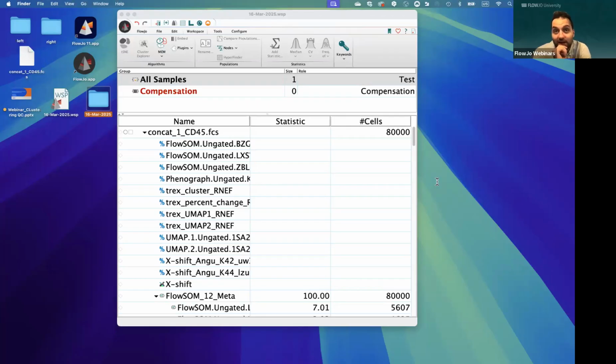It's true you can merge samples together based on a backbone panel, but it's a really big assumption to say that, since those markers are shared between the two samples, this one should also express, I don't know, CCR7 or something.